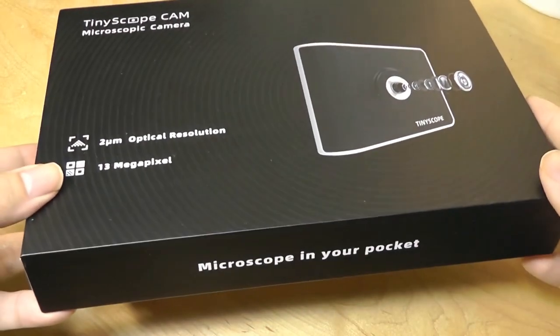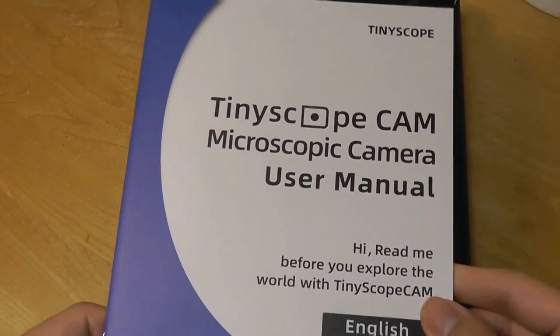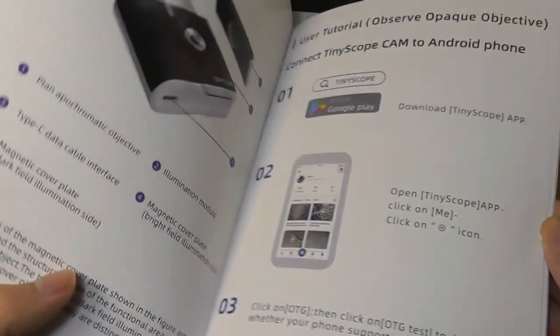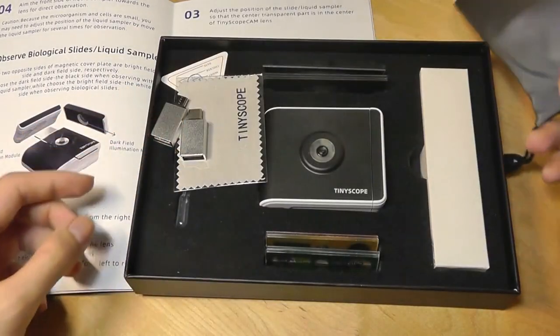So here's the packaging — pretty simple, 'microscope in your pocket.' We also get a user manual that's actually documented pretty well. It says, 'Hi, read me before you explore the world,' and goes through detail and color of how to set it up. And we've got our contents underneath, including a carrying pouch for the microscope.